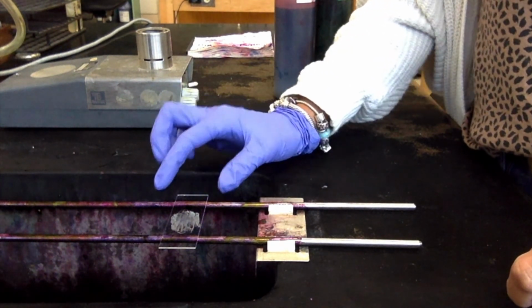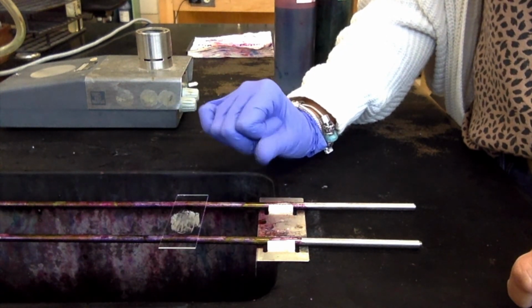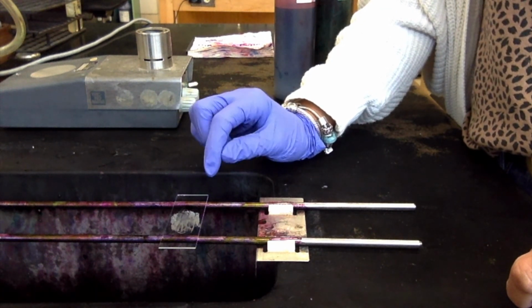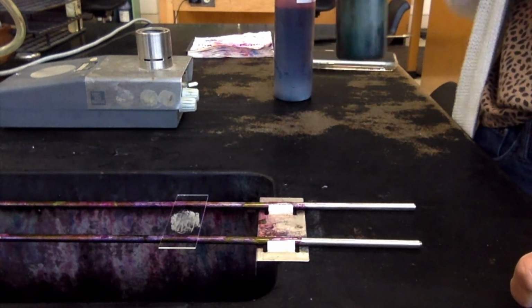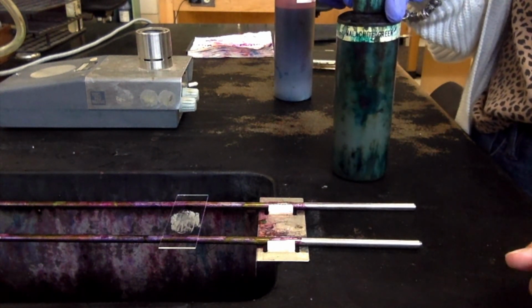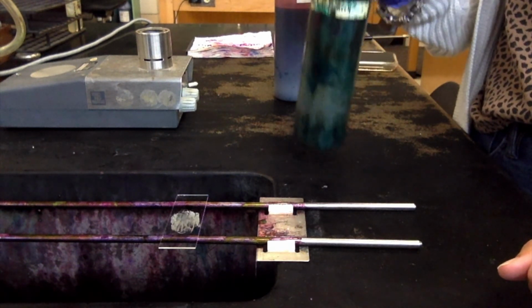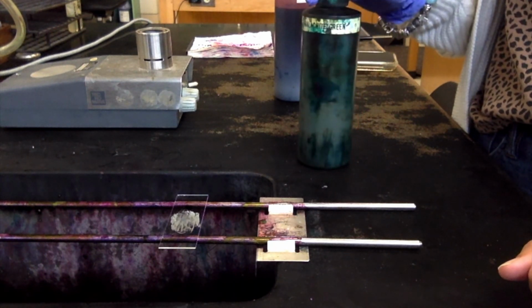As you can see here, I used a bacillus. So we have a bacillus here that we know forms nice spores. So that's the smear that I use, and I've already heat fixed it and all of that, so it's ready to go. And here is my primary dye, which is the malachite green. Now this is one of the strongest dyes that we use in here, so we really want to be careful. We don't want to get this on our clothes, we don't want to get this on our skin, so I always try to make sure to wear gloves whenever we're dealing with this.